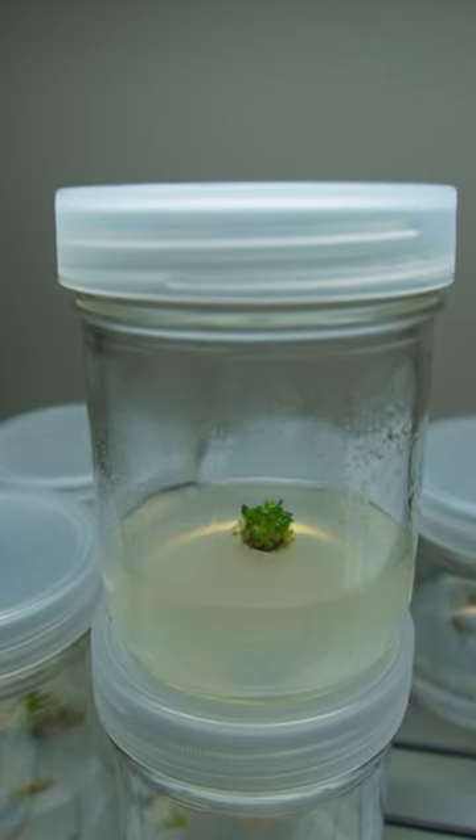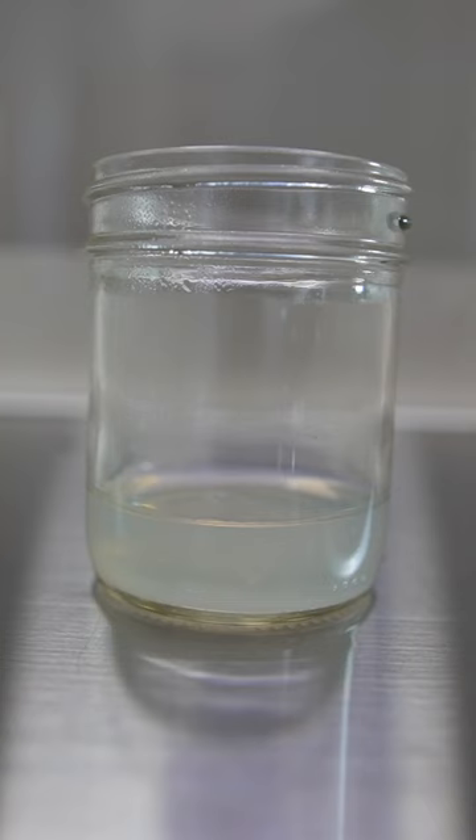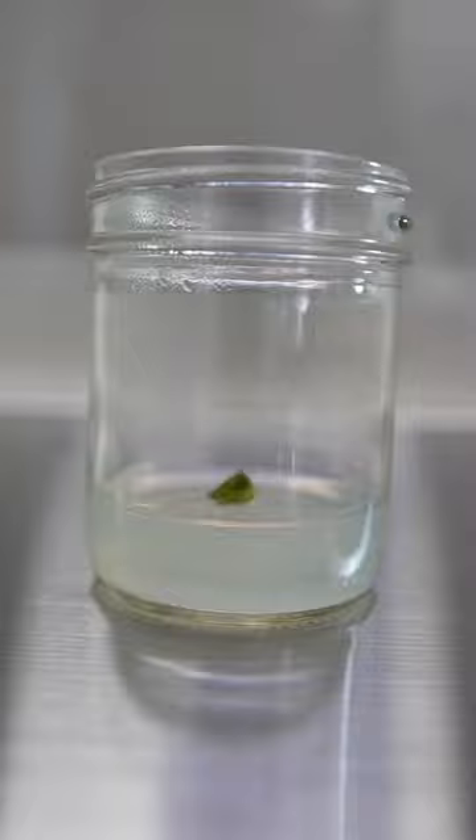Almost every plant in your house started its life in a jar like this one. Plant tissue culture can create infinite plants from a small piece of plant tissue or even a single cell.